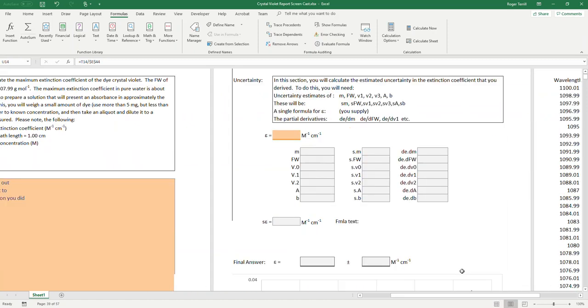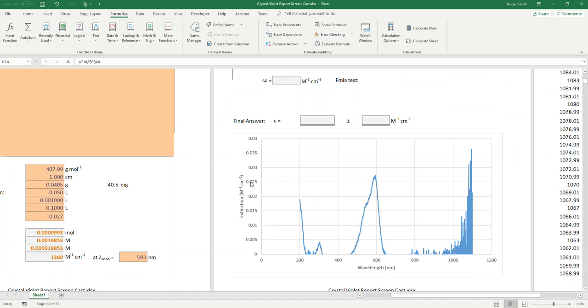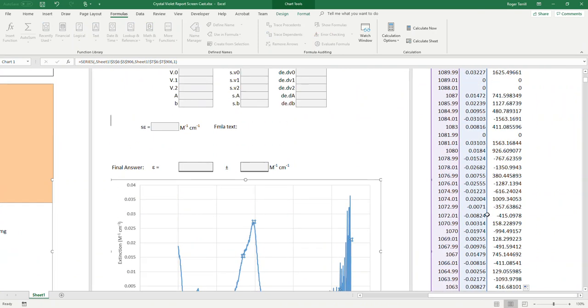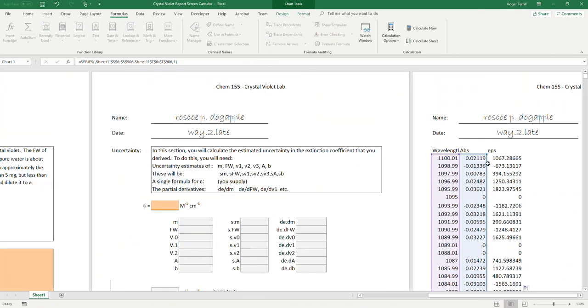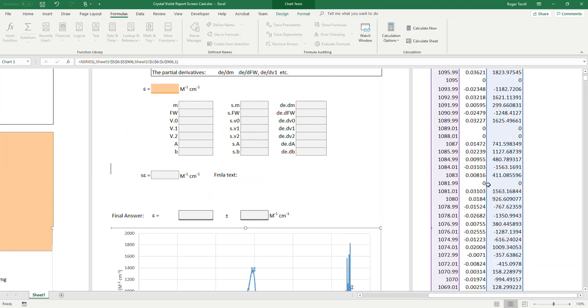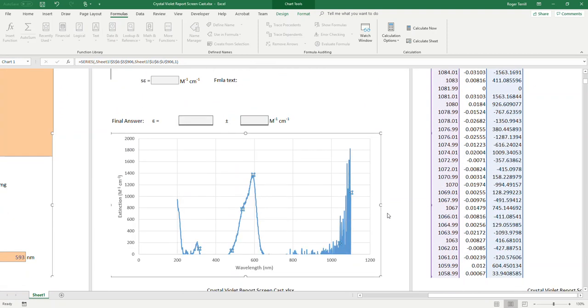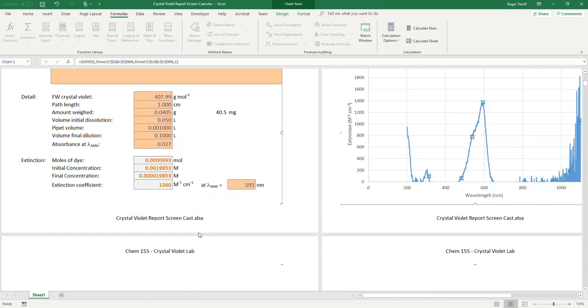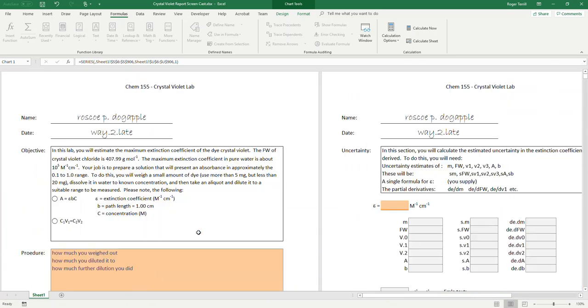So now I'm going to come back over here, and we will highlight this data set, drag it back over to the epsilon column, and there we have it. Now this epsilon is coming out way too small, but that's not important right now. What's important is because I just made these values up. I don't know what these students actually did, right?